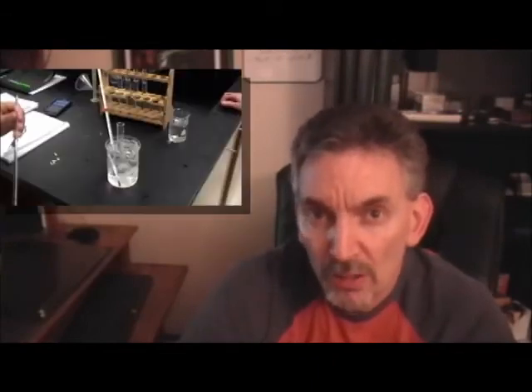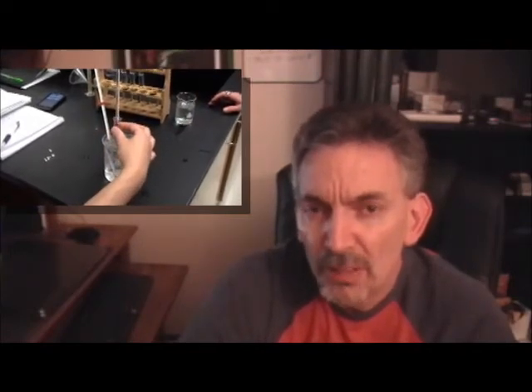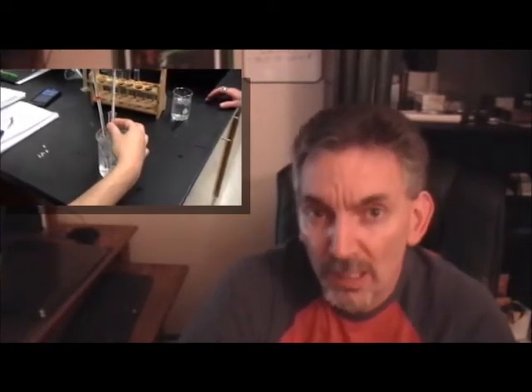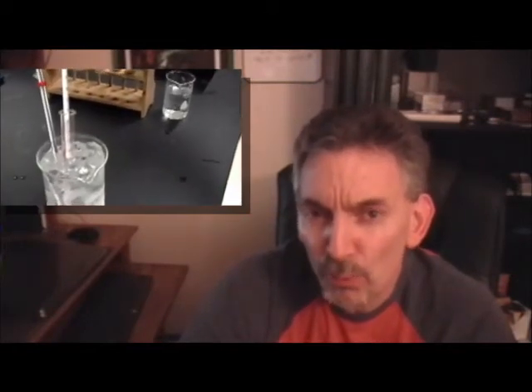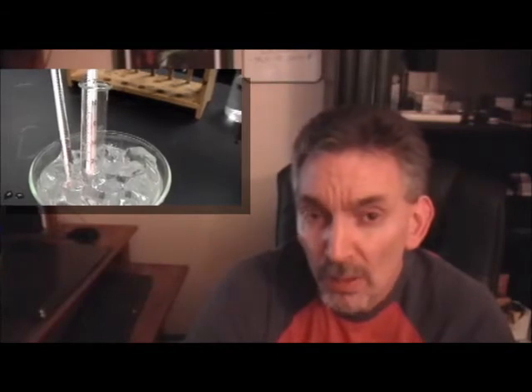So some reactions are carried out below room temperature. You'll need an ice bath. And some reactions are being carried out at above room temperature. Remember, it's not the temperature of the beaker of water which is important, although that has to be right, of course. It's the temperature of the solution inside the test tube.